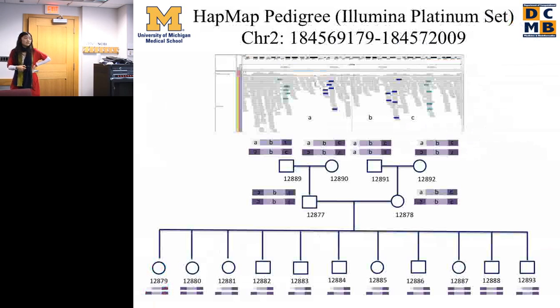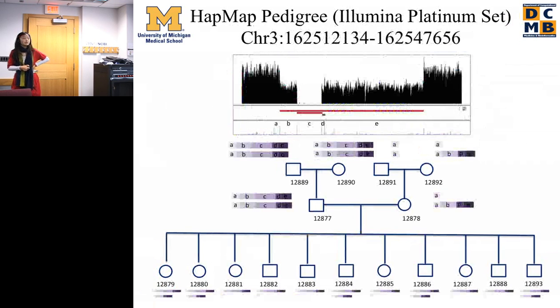We haven't validated it in the wet lab, but look at the structure: it follows the Mendelian rules, and we also tried to verify it with the PacBio data we have. For this case, the PacBio data first support all the breakpoints we have, and also support this structure. For the next step, we will send the samples to the wet lab to validate all these structures.